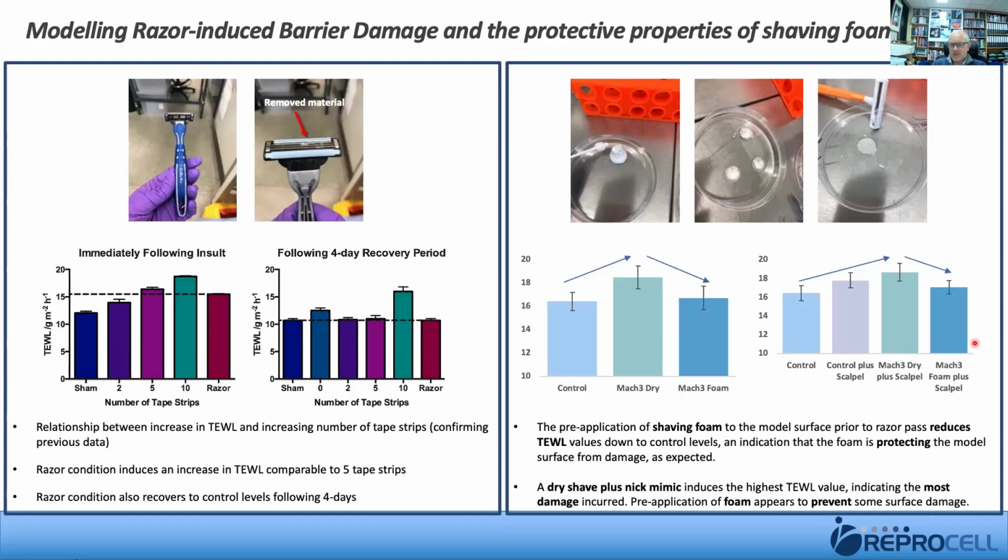And you can see the differences between dry shave versus the inclusion of a shaving gel. This is important for, of course, if you're interested in developing these sorts of consumer products. This is an assay which can be utilized.